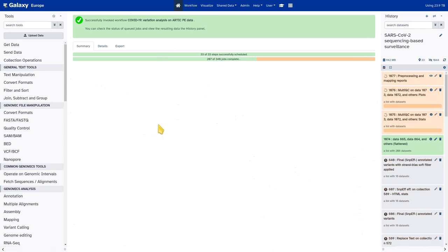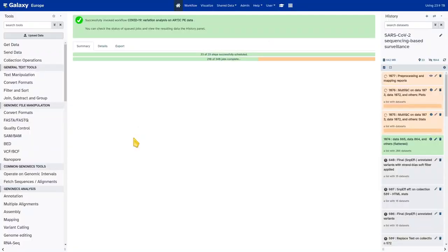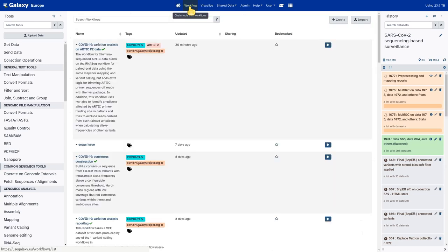Going back to the overview, the next one will be the COVID-19 variation analysis reporting workflow. It will run on the collection of VCF datasets with mutations per each sample in our batch and create those plots and reports. Like the workflow before, we're going to obtain this from WorkflowHub — it's the exact same procedure. Go to Workflow, import from a GA4GH server.